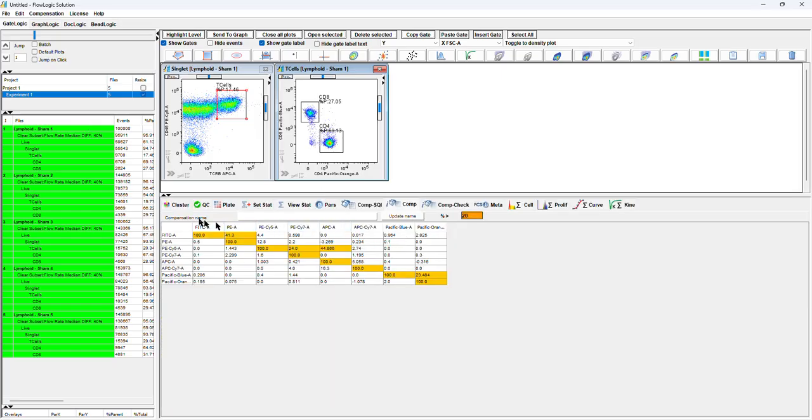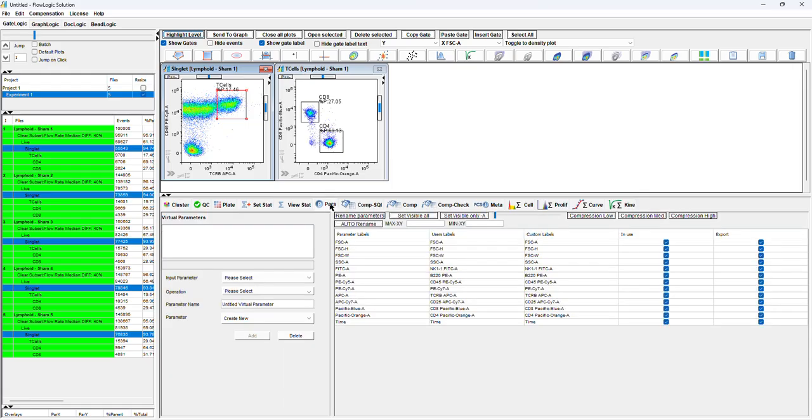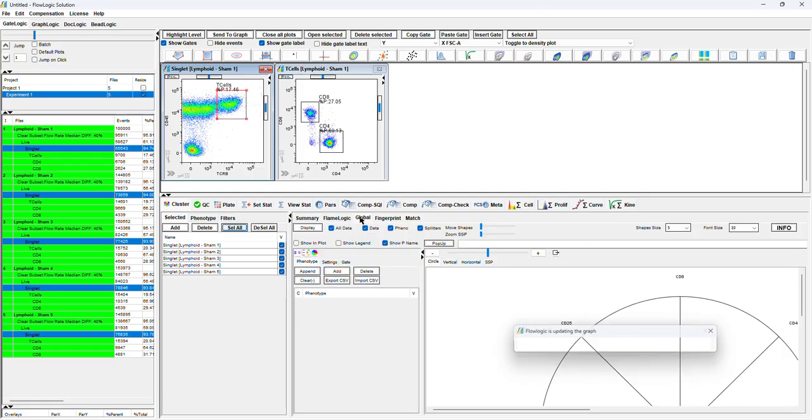We go and we start to see the data. We want to see the data in our global, because it's quite useful to visualize the data in global. Now, one of the things that we have to do before visualizing data in global, we start from the singlet parameter, and we have to do a renaming of the parameter just to shorten the custom label. And because we select these, everything gets renamed correctly. Again, we align level, we add to the table, select all, and then we go to global.